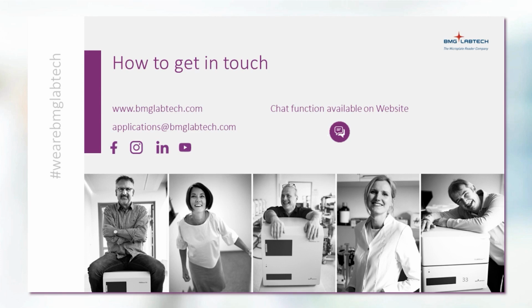Since the gain value is an artificially set multiplication factor, and its determination and range is different between different readers. So a gain of 1000 on one reader won't yield the same results as a gain of 1000 on another reader. To optimize the gain individually is especially important in the case of microplate readers from different manufacturers, as the gain range will differ substantially between manufacturers.